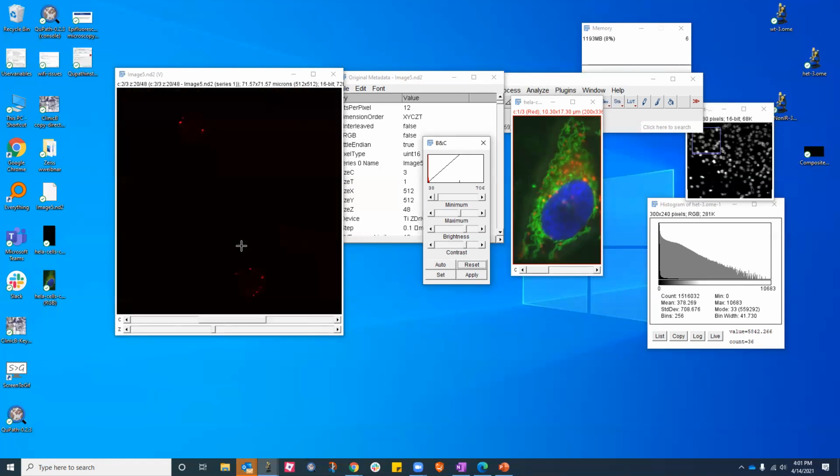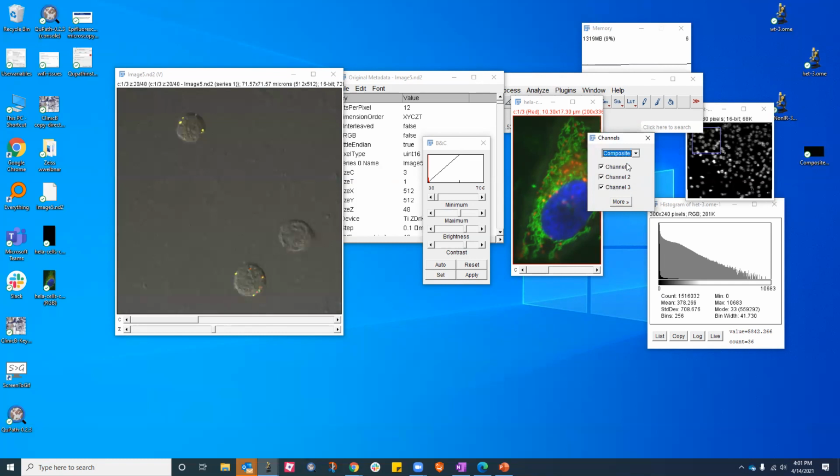Okay. So herein, I can make a composite image. I can go to Shift, Control, and Z, do a composite. So now I can see all of them together, right? Oh, that's cool. So let's just look at one cell. So I'll duplicate this, right? And let's see, do we need all of them, right?